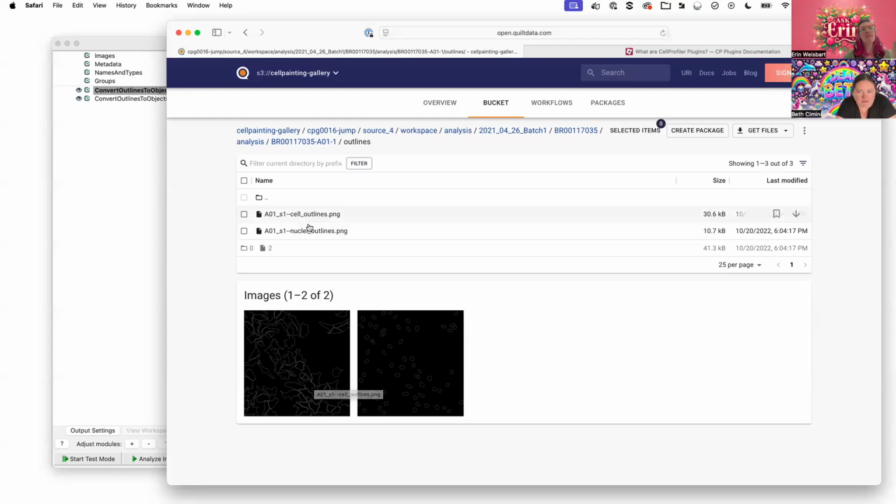But I believe we ended up... Can you explain that a little bit more in detail? I'm not sure I totally got that. Yes. If only I had an example readily available, that would be super helpful. How about I hold that thought, Beth.